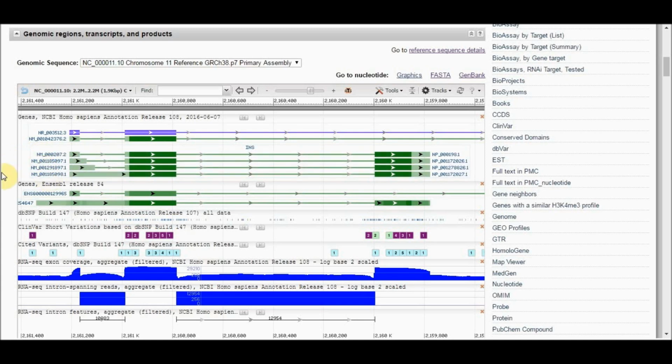If we are evaluating the insulin gene expression on the gene level in a novel cell, then we have to carefully choose which one of these 4 mRNA transcripts we need to use to design a primer. The trick is, we have to design a primer within an exon region that is shared by all the 4 transcripts, because we don't know which transcript is expressed in the novel cells.